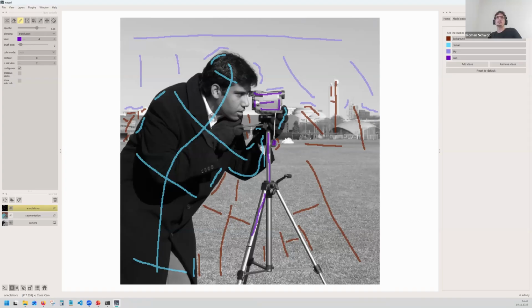I just saw that there was a question about training on multiple images. I'll get to that in a second.